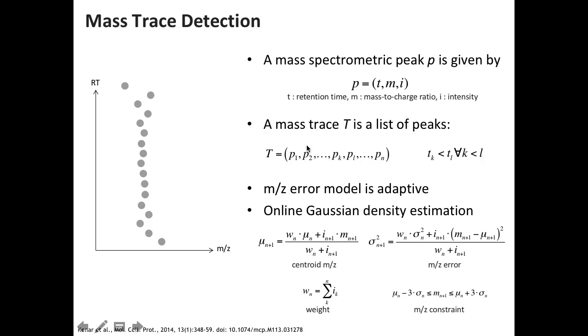So what we're going to do is use online Gaussian density estimation. It's basically computing the local error standard deviation online, and updating the error as we go along. And that is quite straightforward. We start with one peak, and these error bars indicate our nominal mass error. That is what we start with. That is what we should expect from the instrument. Now, we check for peaks to the left and to the right of that mass trace and check whether they are within this error bound. In this case, yeah, that's true. We add this peak to the mass trace. Now we have two peaks.